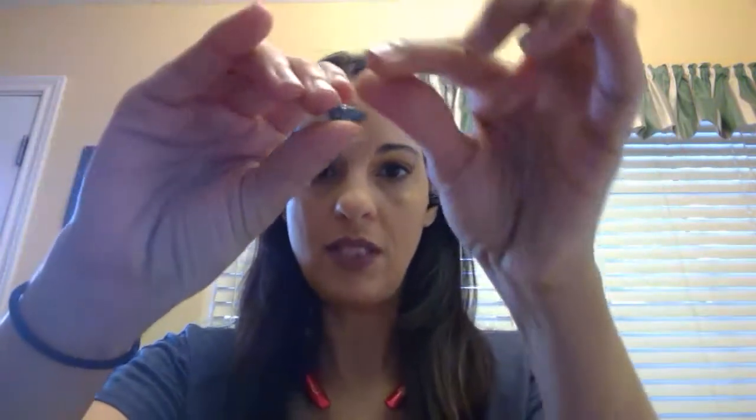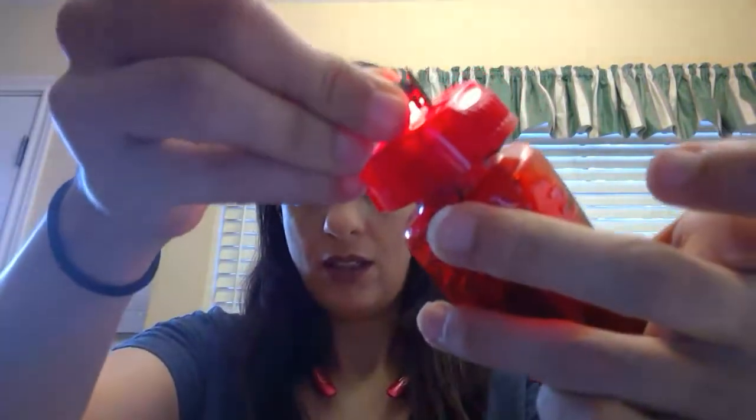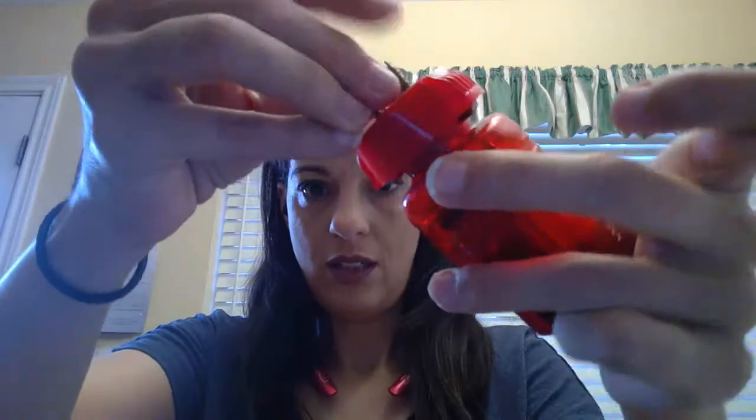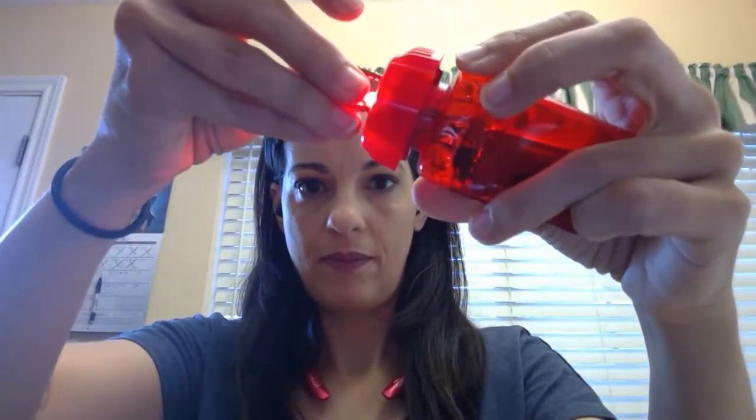Okay, here is element number 2. Again, I can see that it is reflective. There's pieces of it that are catching the light. However, I can tell from the jagged edges of this that if I took a hammer to this, it would break into little pieces. Okay, and if I use my conductivity tester, it does light up. Okay, so fill out your chart for element number 2.